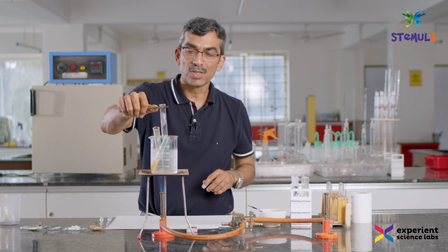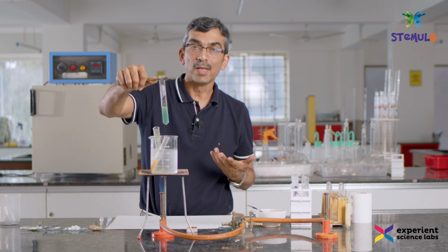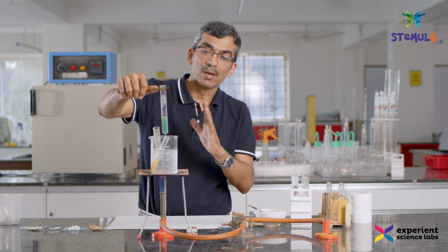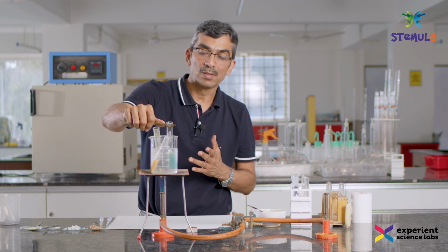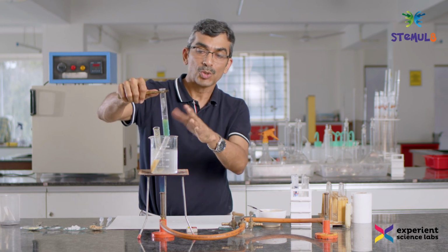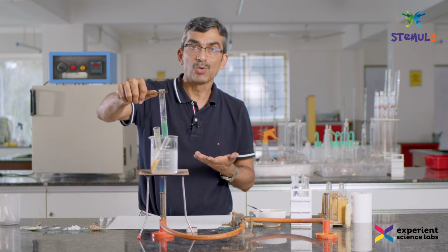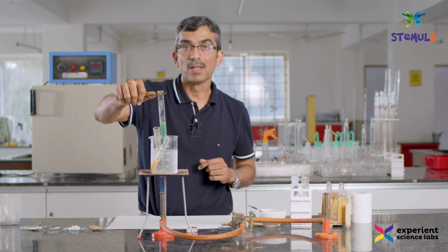And this color is changing a bit from dark blue. It has become a nice looking green. If I keep it on for some time, you see on the top it is slightly turning a bit lighter and going towards yellow, which shows that this was our reference solution. It shows how the color change happens. If you recall, I just added maybe 2 micro spatulas of sugar in around 4 ml of water, and this is the color that I get.